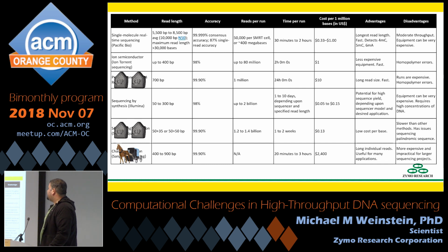However, the length of the reads is absolutely astounding. I think we've gotten reads now that are in 6 figures, definitely well into 5 figures, but I think people are getting reads now routinely into the hundreds of thousands of bases on a single read. So if you need a very long read, and I'll go into why that can be important later, PacBio is excellent. If you need a very accurate read, typically Illumina is a little bit better. And of course, as I mentioned before, if you need a super accurate read on a very limited piece of DNA, typically you're going to do Sanger, which is very cheap but very low throughput.